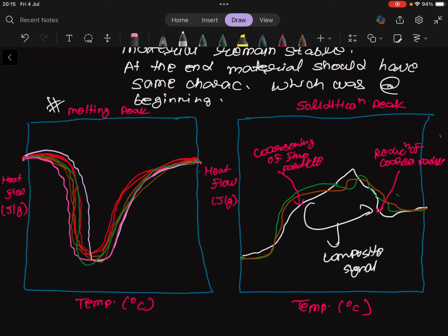So is it good or is it bad? If you have a shorter temperature window when it's melting and a larger temperature window when solidifying, it is not strictly good nor strictly bad. It is bad if the temperature range in which solidification occurs is so large that we are not able to have complete solidification of our system before the cycle starts. And it can be good if we don't need a sudden release, and we just want to absorb excess heat and then release it slowly, to control the temperature range a little better. So we should know the temperature range in which we want to work.